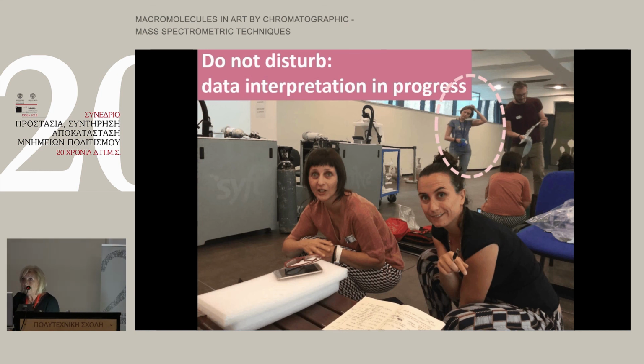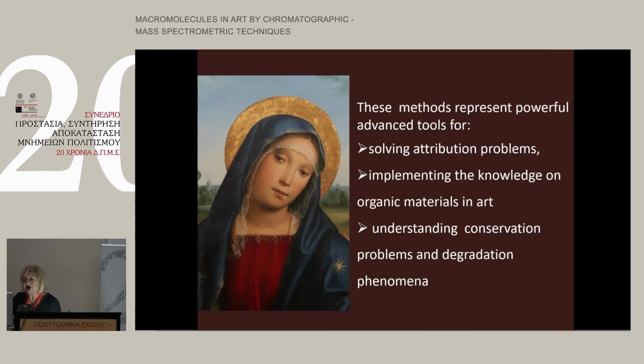But finally, if I want to be sure of what is contained in a vessel or in a painting, at least one sample has to be sacrificed, and HPLC, GC-MS and Py-GC-MS have to be applied to be certain about our results.